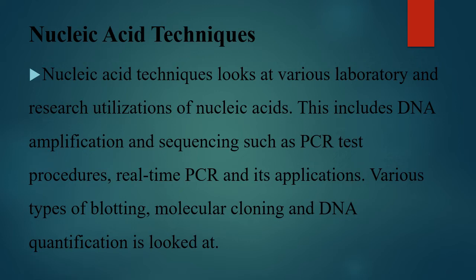So in nucleic acid techniques for molecular diagnostics, we look at DNA amplification and sequencing, such as the PCR test procedures. Then we look at RT-PCR, real-time PCR and its applications, various techniques for blotting, molecular cloning, and then DNA quantification.